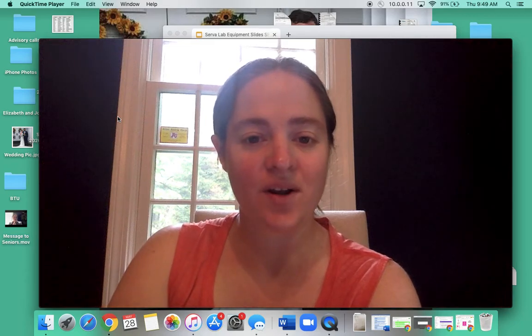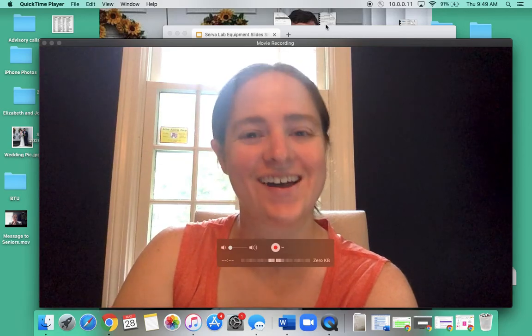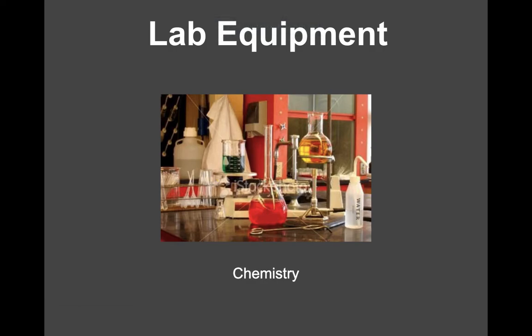In this video, we're going to talk about the different types of lab equipment that we're going to use this year in lab. So let's get started. There's a lot of different types of lab equipment that we're going to use, and we need to make sure that you and your lab partner stay safe in class. So let's talk about a few of the common lab equipment.